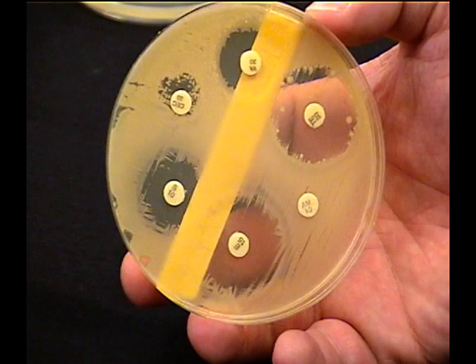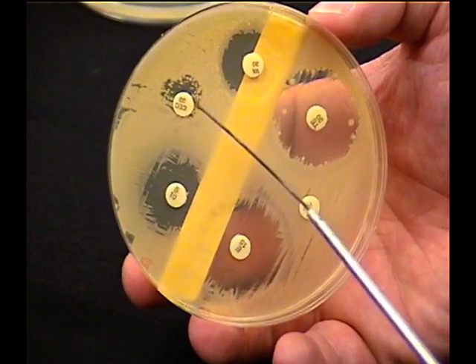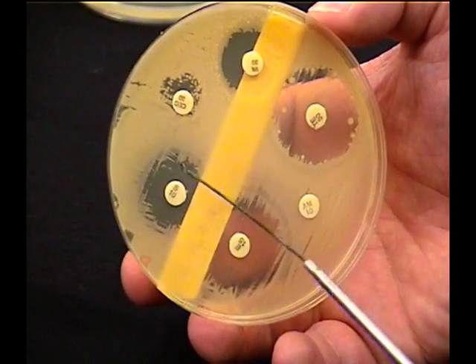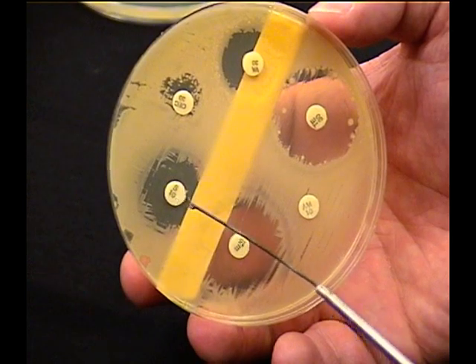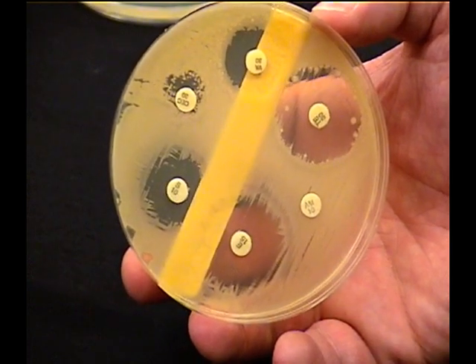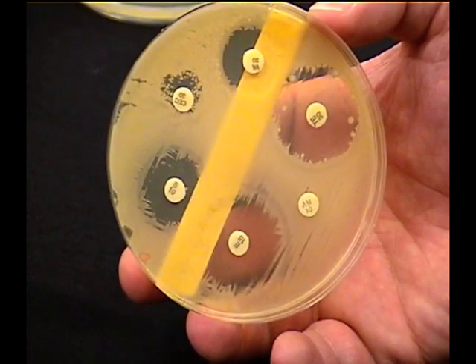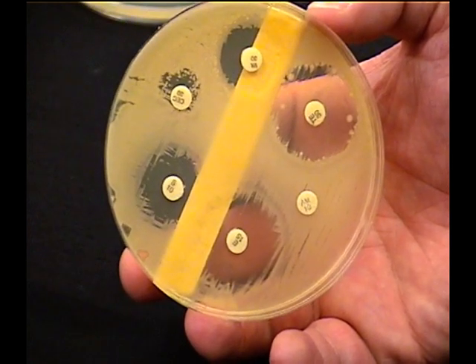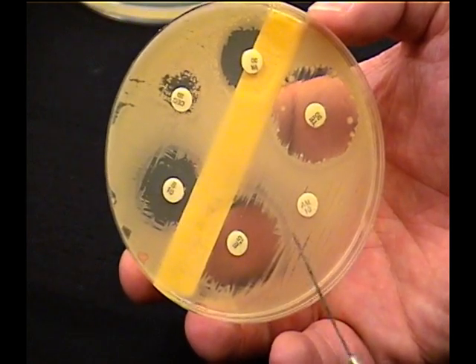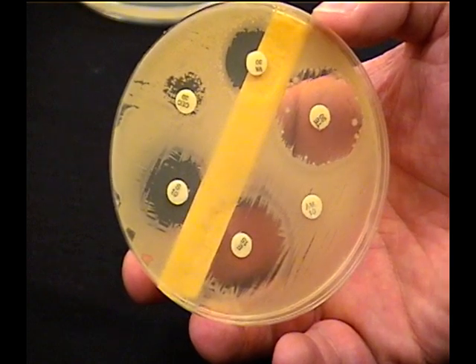As we go around, you can see slightly bigger areas, clear areas around the outside. The clear areas are zones of inhibition, as they're called. One would think that the bigger it is, the better it is. Well, not necessarily.